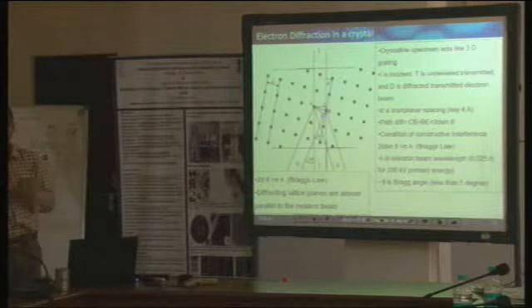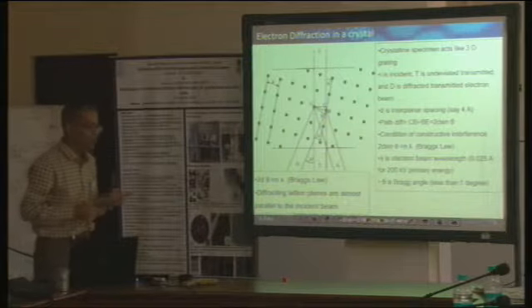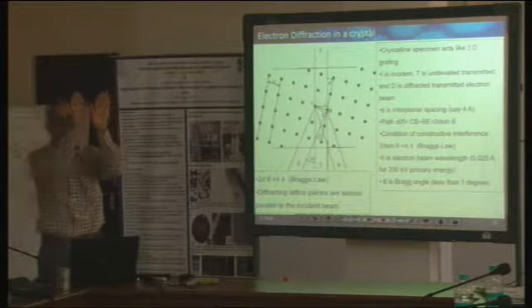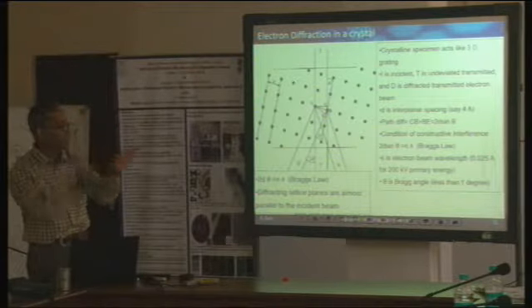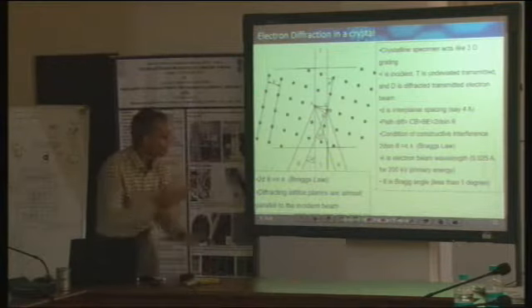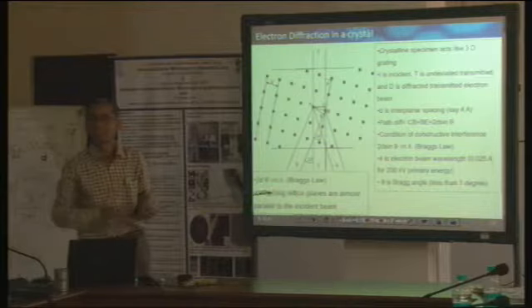Now why does this have any relation to my material? It has relation in the following way. Like in the earlier image I said, there were 2 grains, one was like this, another was like this. Even if they were only slightly tilted from each other, even if that tilt was, let's say, 0.01 degree, this equation in electron microscopy will change in a very drastic manner.